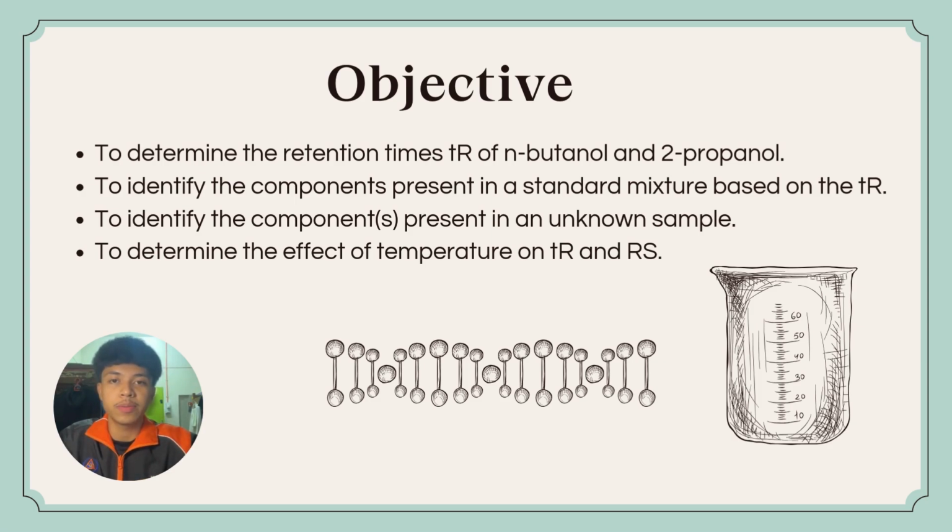Objective of this experiment: first, to determine the retention time of N-butanol and 2-propanol. Second, to identify the components present in a standard mixture based on the retention time. Third, to identify the components present in an unknown sample. And last, to determine the effect of temperature on retention time and resolution.